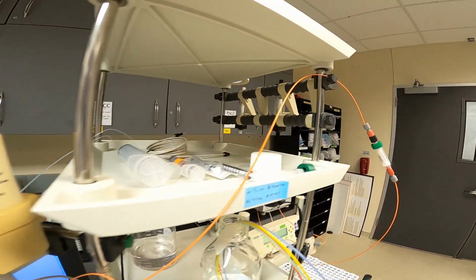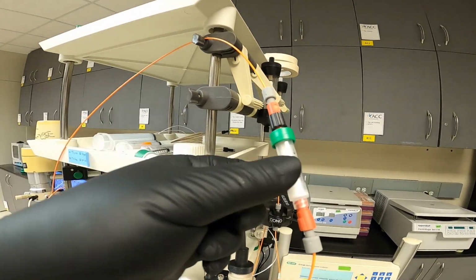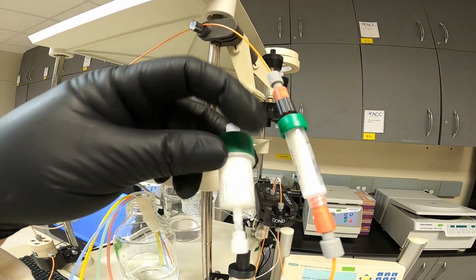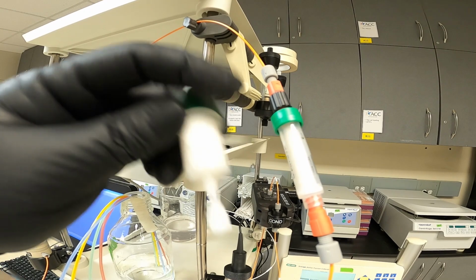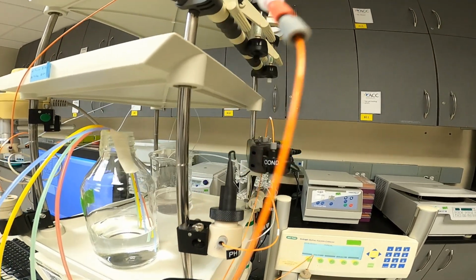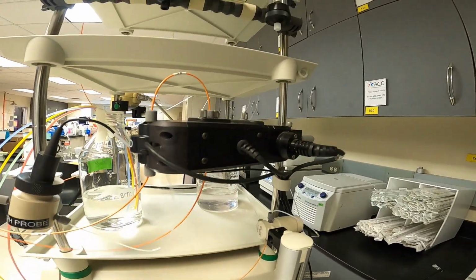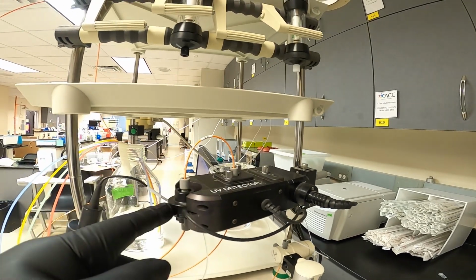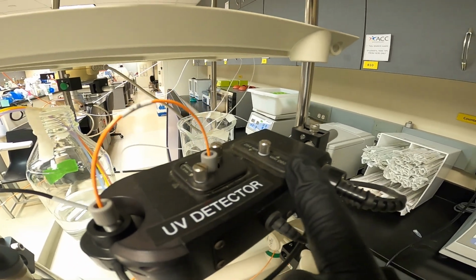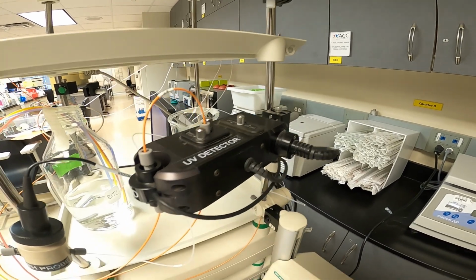So we'll continue down line here to our column. So this is a pre-packed 1 milliliter column. Just for comparison, this is a 5 milliliter column, so there's 5 milliliters of resin packed inside these columns. You can buy these directly from the manufacturer. And then we'll just keep following to the detectors back here. So this housing contains the UV detector and the conductivity meter. See here, there's a filter, 280 nanometers, standard for proteins. There are other detectors that you can measure additional wavelengths.